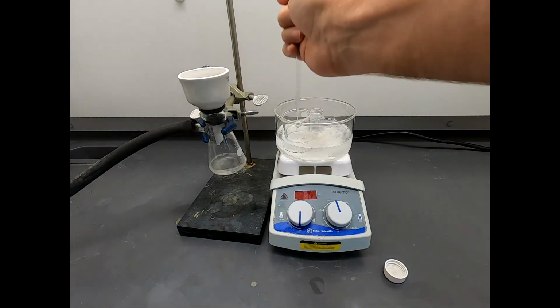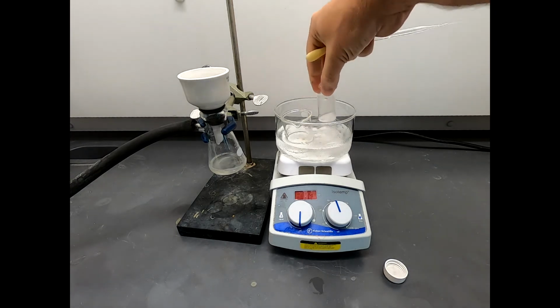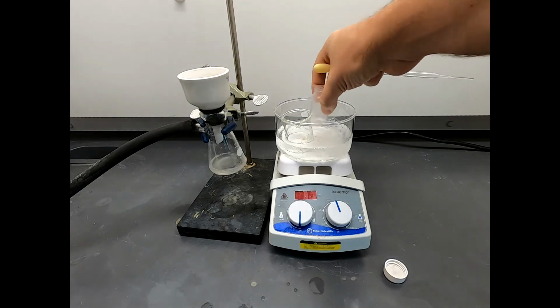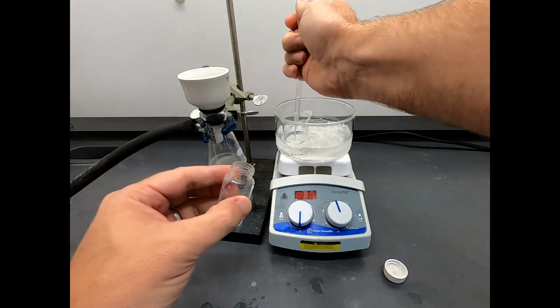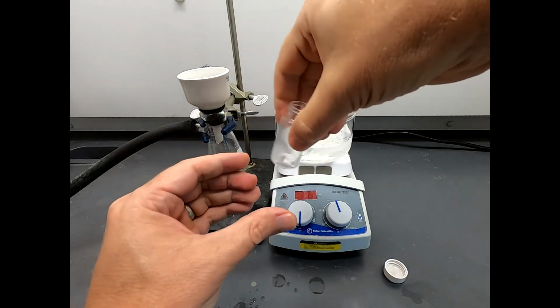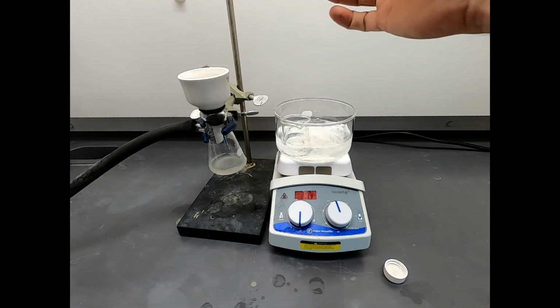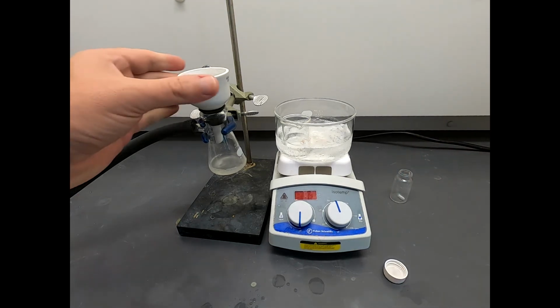Now, get some of our rinse solvent, and mix that around. Good, good. And I said I'm not going to worry about the stir bar. Whoa, oh boy. Things float in water. Sometimes you forget. Let's just do one more rinse. Since I haven't gotten the stir bar in there yet, I'm going to be careful and pour it a little more slowly. There we go. And the stir bar is still in the vial. That's good. Not a big deal if it falls in.